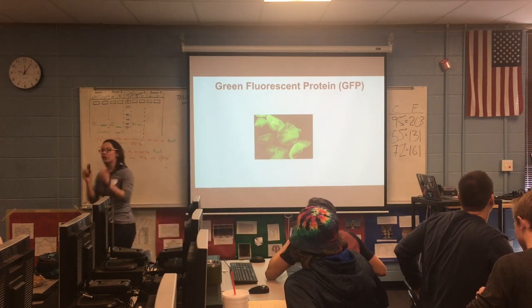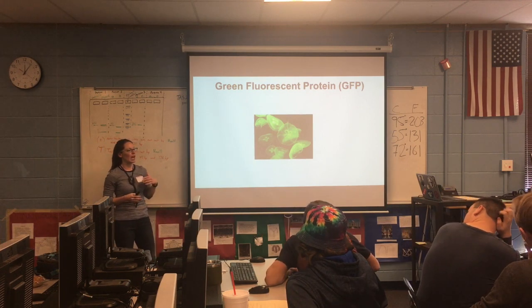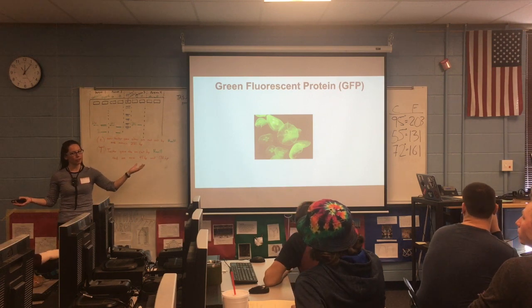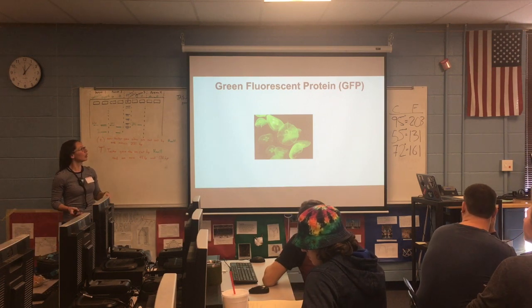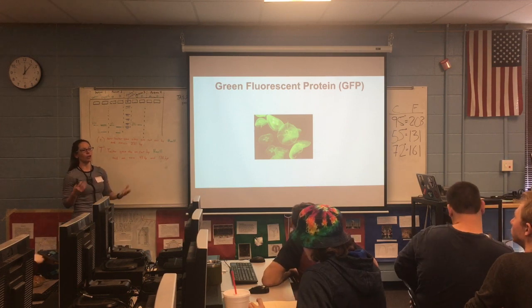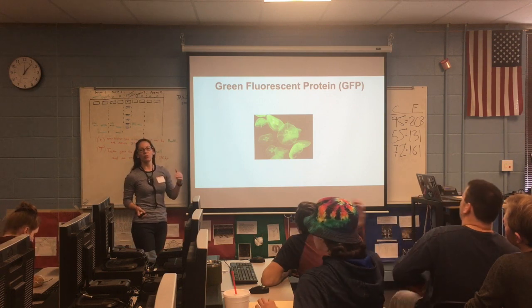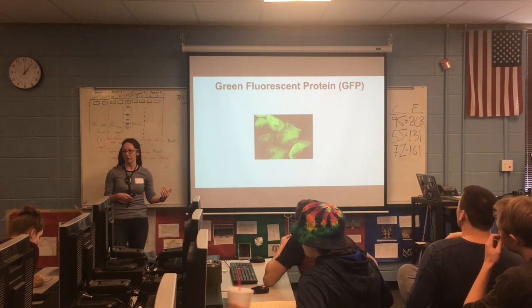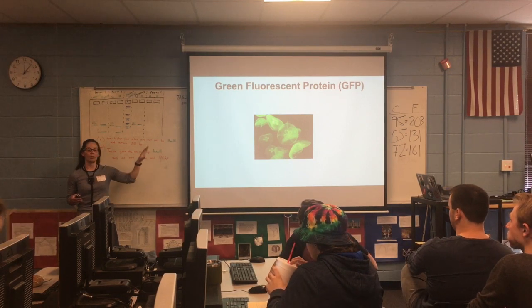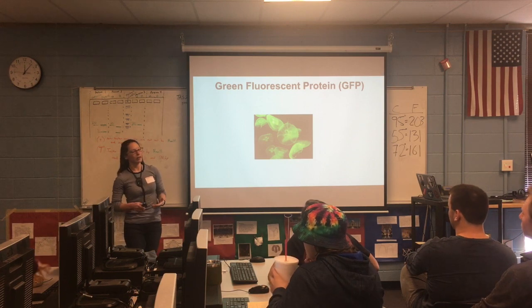Hello again. So I'm going to talk to you today about mutations and how we use them in the lab. So you guys have been doing a lab, and you're going to finish it today, I think, looking at kind of natural mutations that are just part of your DNA. In the lab, there are times when we specifically want to make a specific mutation, and that's what you guys are going to do with me in this lab that we're going to start today. So I'm going to talk about why we might want to do that.